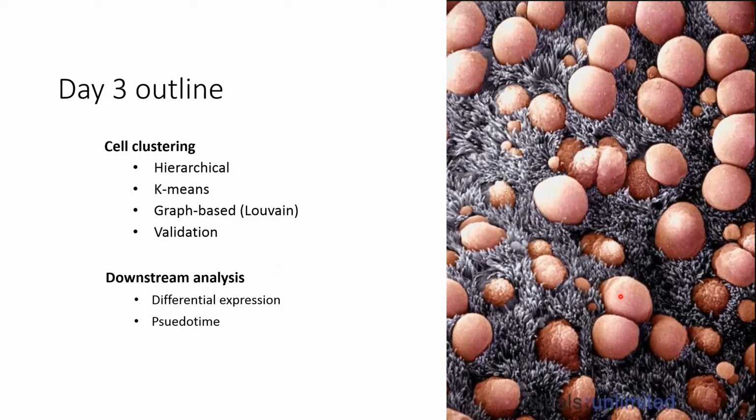And in case you were wondering, these cells are cells that we've been protecting for the last year. They're different types of cells lining the bronchiole of our respiratory tracts.